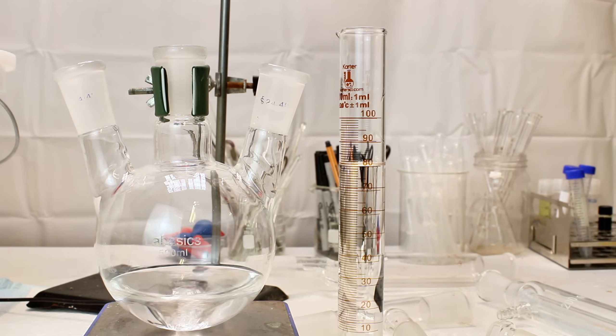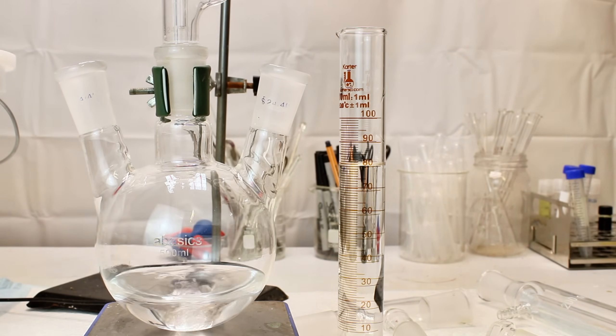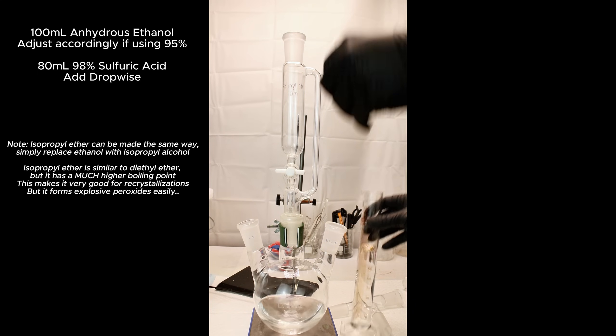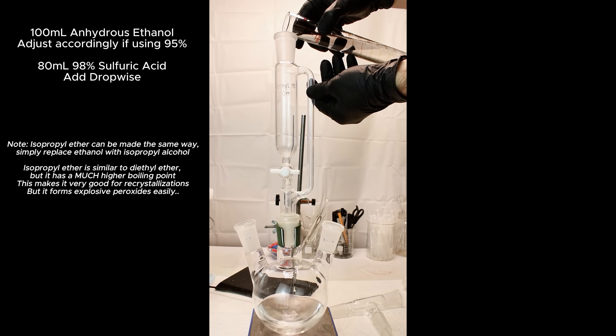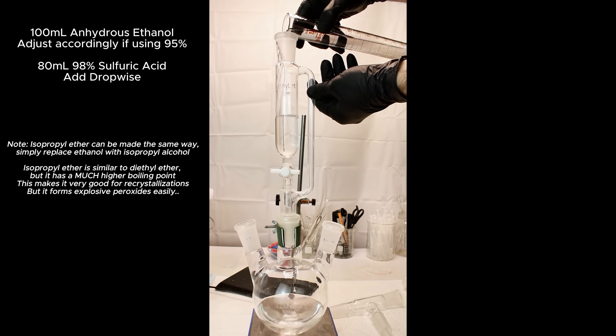My main use for diethyl ether is as a solvent, which I'll talk about later in the video. To get started, I add 100ml of anhydrous ethanol to a three-neck round bottom boiling flask along with a magnetic stir bar.